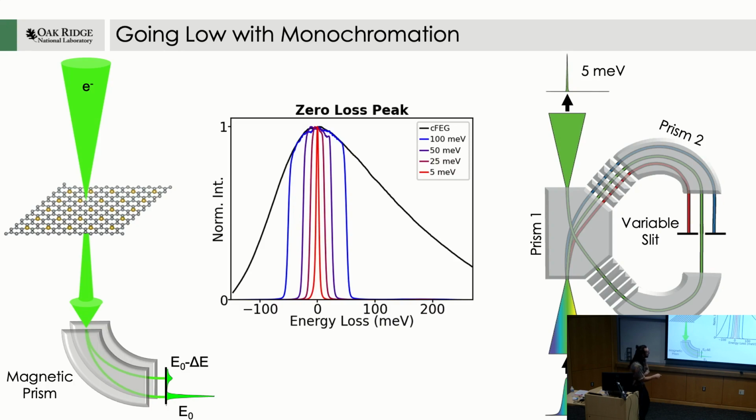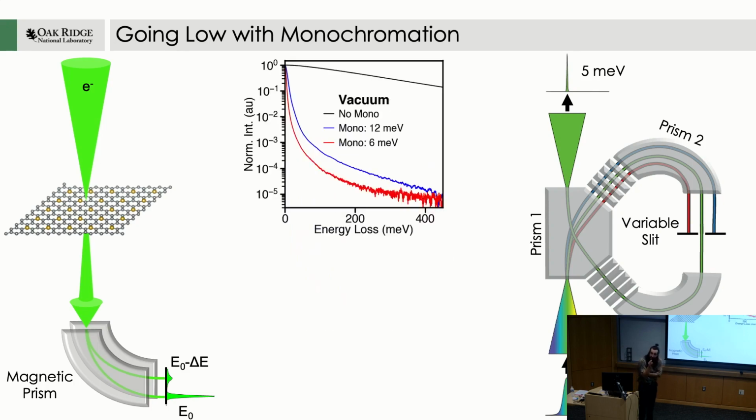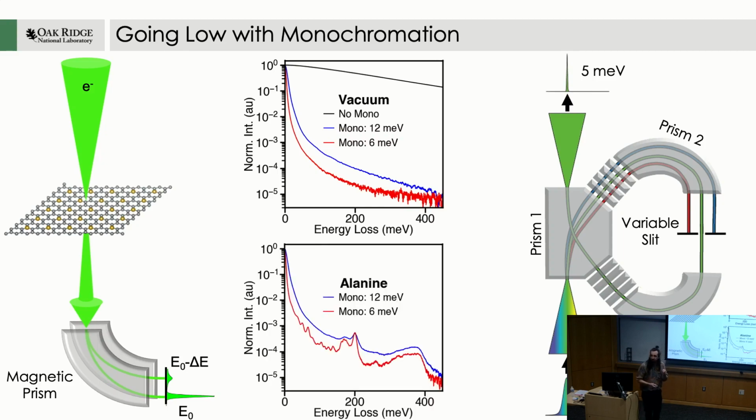Thank you. And so when we're down here, we've not just improved our energy resolution, we've also reduced our background significantly. And the effect of this can be really quite dramatic. I wanted to show you a comparison of two different levels of monochromation, 6 and 12 meV. And this may not seem like a lot. You can see certainly in terms of the background reduction, it's pretty comparable. But now let's take a look at what the vibrational spectrum of an amino acid, L-alanine, looks like at these two different levels of monochromation. And we see that it's a totally different world. And this is the reason why getting down to this sort of 5 meV level was so transformative.